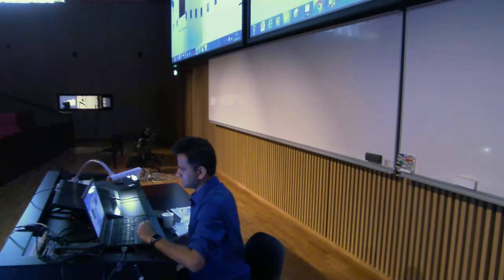Because this is a kind of overlay now, this is a selection, but it is possible to make that a part of the image. And how to do that? You just go to edit and you say draw. Now it's a part of that particular image. How to change the color for that? You just click here, and then this is a foreground color and this is a background color. Foreground color is this one. This is how you change it.